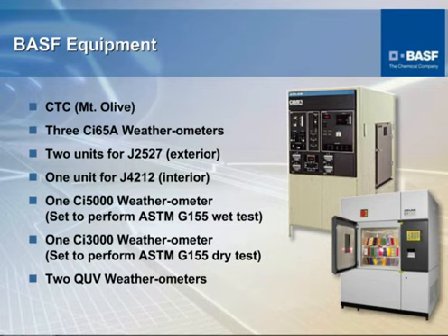This is a list of the equipment that we have available here at Budd Lake in Mount Olive. There's 3 CI65s. That's a weatherometer that's represented by the diagram that I showed you before. We have 3 of those. 2 of them do exterior testing. 1 of them does interior.